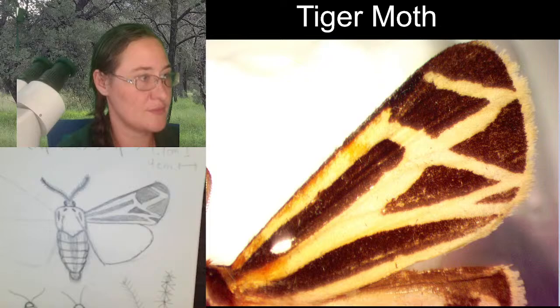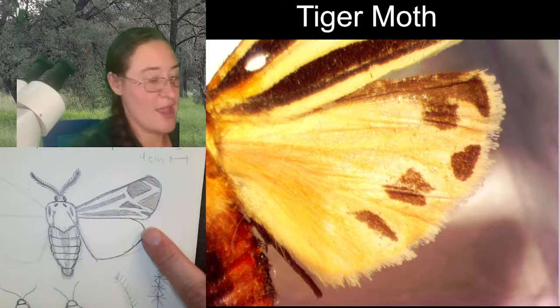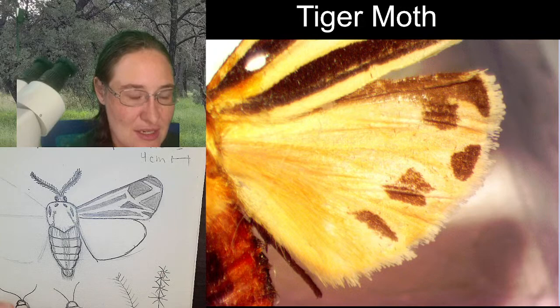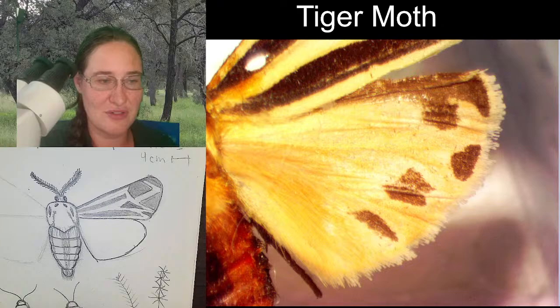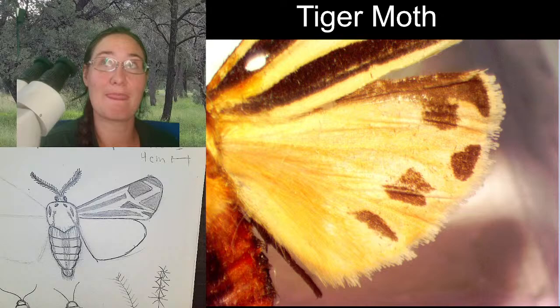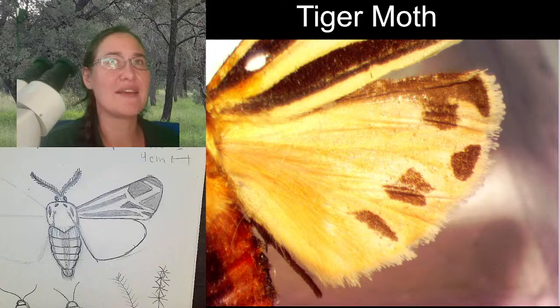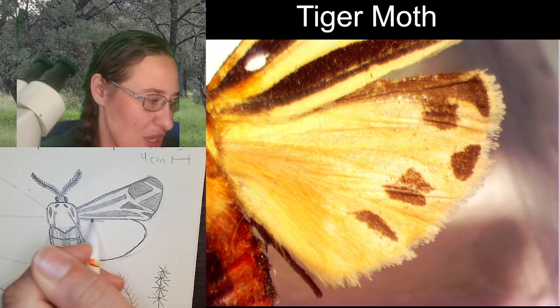All right, let's check out some hind wings. Now, on both sides of the hind wings, you have that hooked dark space, and you have that spot that's actually connected. But lots of tiger moths are day flying, aren't they? And butterflies have the fringe too. You make a good point. This specimen is night flying. The Isabella tiger moth is night flying. I'm sure that there are day flying tiger moths out there, but the ones that I can think of off the top of my head right now are night flying.